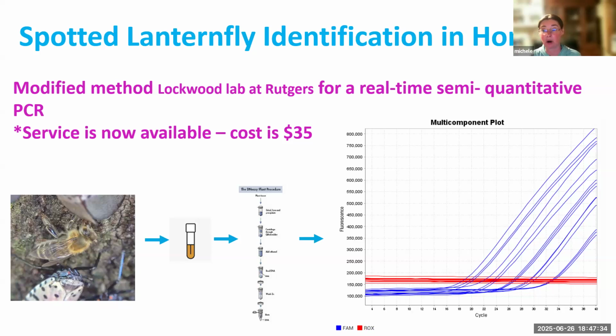That happened one time because we had off the wall numbers and they were like, oh wait, we think it got contaminated with an actual bug. And I was like, well, yeah, that's going to set alarms off pretty high. Interestingly, we can detect it even from the nymphs very, very early in the season. So there's some potential to use honey as a monitoring tool, because they're going to be within a radius. We mostly know what host they feed on. So if you've got eradication teams, in theory, yes, you could use honey or something else to be able to detect it. But again, hopefully you guys will never, ever have to use this method.